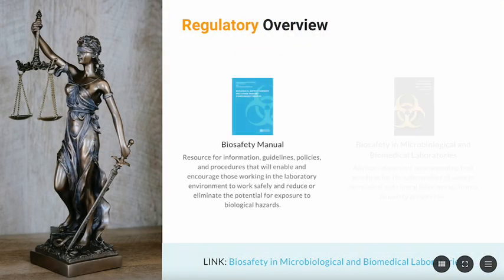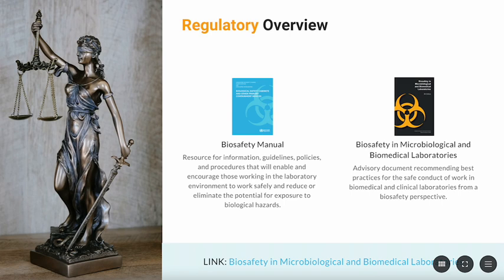The Biosafety Manual is a valuable resource tool for laboratory workers, providing information, guidelines, policies, and procedures to promote safe work practices and reduce the potential for exposure to biological hazards. It covers a wide range of topics, including safe handling of materials, lab procedures, and emergency measures. Additionally, the resource includes the Biosafety in Microbiological and Biomedical Laboratories Advisory Document, which offers best practices for conducting safe work in biomedical and clinical labs from a biosafety perspective. By using the guidelines in the manual, lab workers can confidently and safely conduct their work.